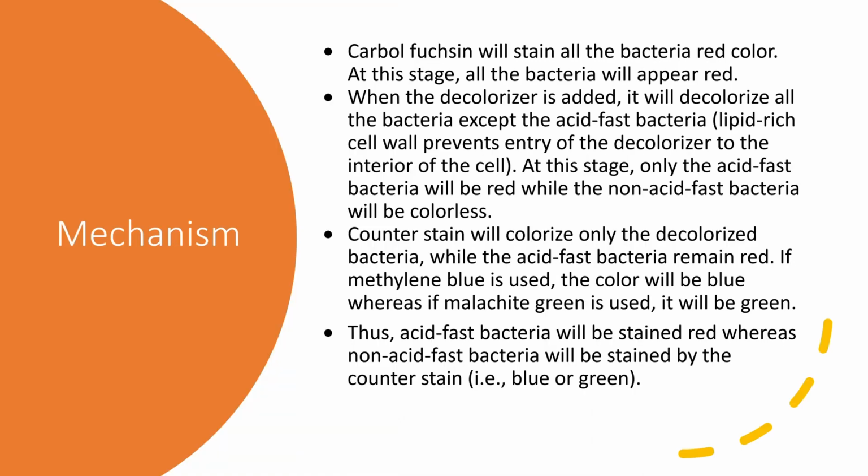So this is the important step. Our topic is mechanism. Now we are going to try to understand the mechanism: why some bacteria become acid-fast, why others are non-acid-fast. So we are going to see how it works.